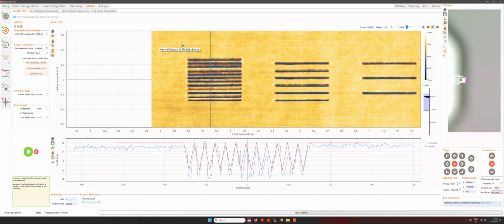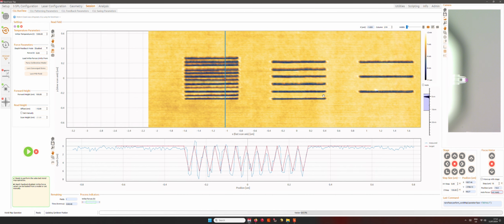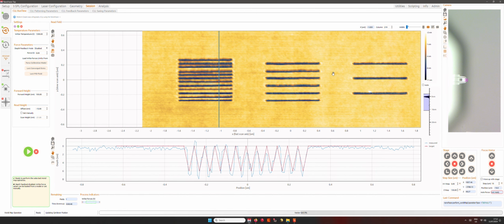It was probably slightly better for the transfer process in the example shown before, but I hope this video, which I wanted to keep short, can help you to pattern successfully on insulating substrates in high resolution using the thermal bending effect. These are advanced features for, I hope, advanced users, and I hope that this can help you with your research.